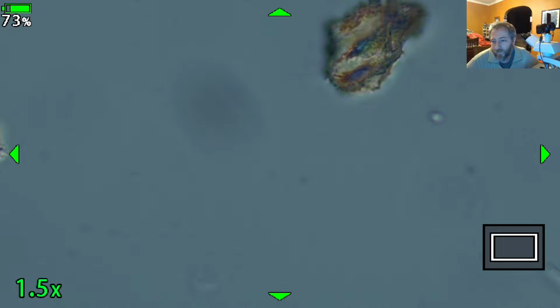So let's see. I know I missed something here for a second. Pacific Plankton said, do any of the processes you use cause damage to any diatoms? They do. If they're lightly silicified diatoms, there's a possibility that the diatom will be completely destroyed.